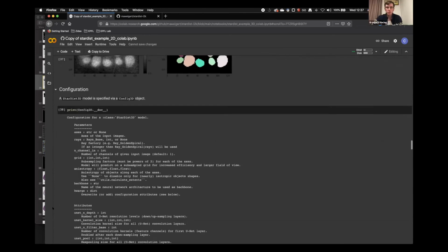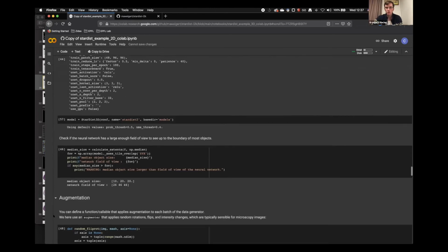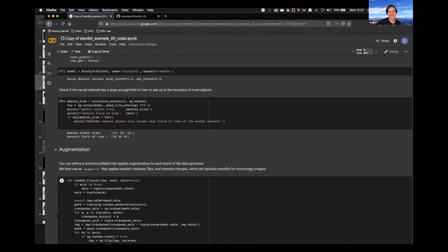And can we somehow tune it, if we know that certain things are in certain channels? That's a good question. You can do it now, but you would have to extend the network. That's an interesting question.